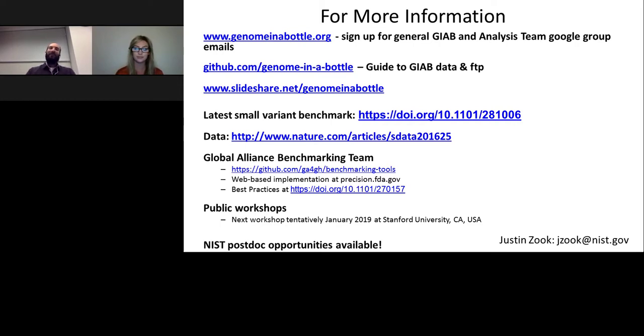Yeah, so we've definitely already been finding these to be really useful in characterizing structural variation. In particular, when we're trying to characterize this structural variation in long repetitive regions, or in places where there are large insertions, it's been really useful to have long read information, and we're really excited about getting the even longer reads that we're working on, because we expect this will help us to continue characterizing longer repeats and longer insertions with more confidence.